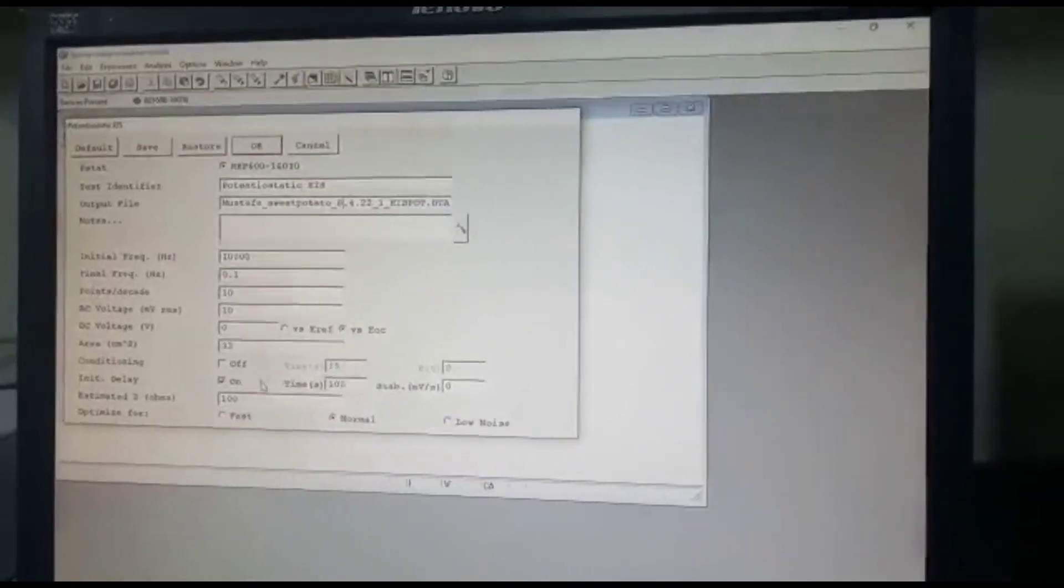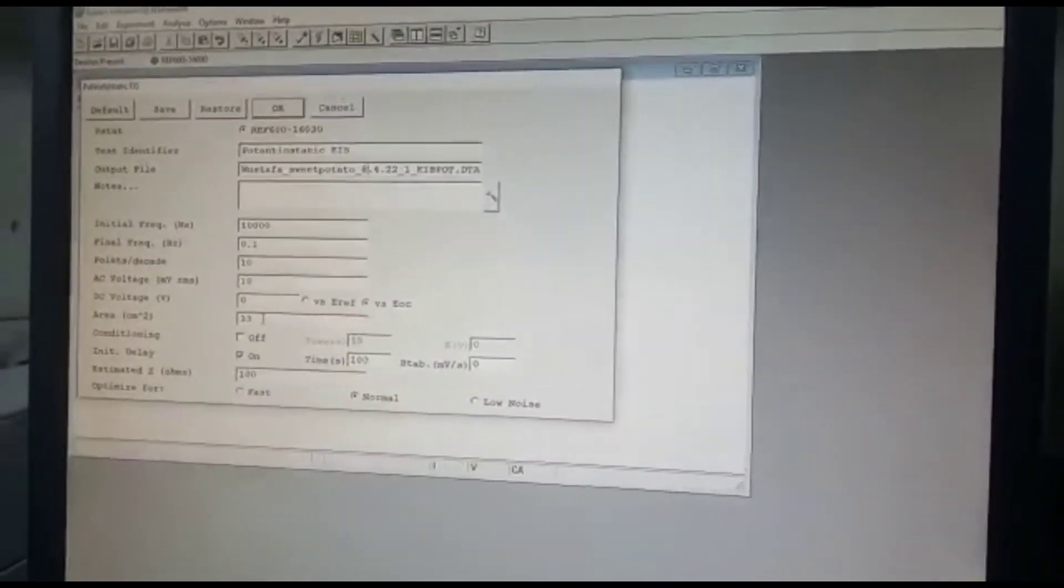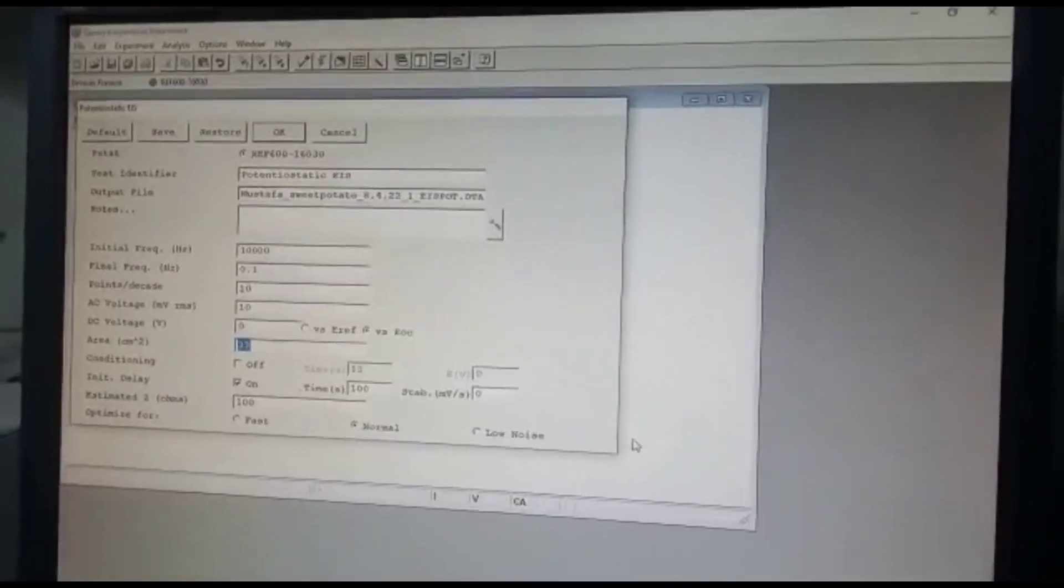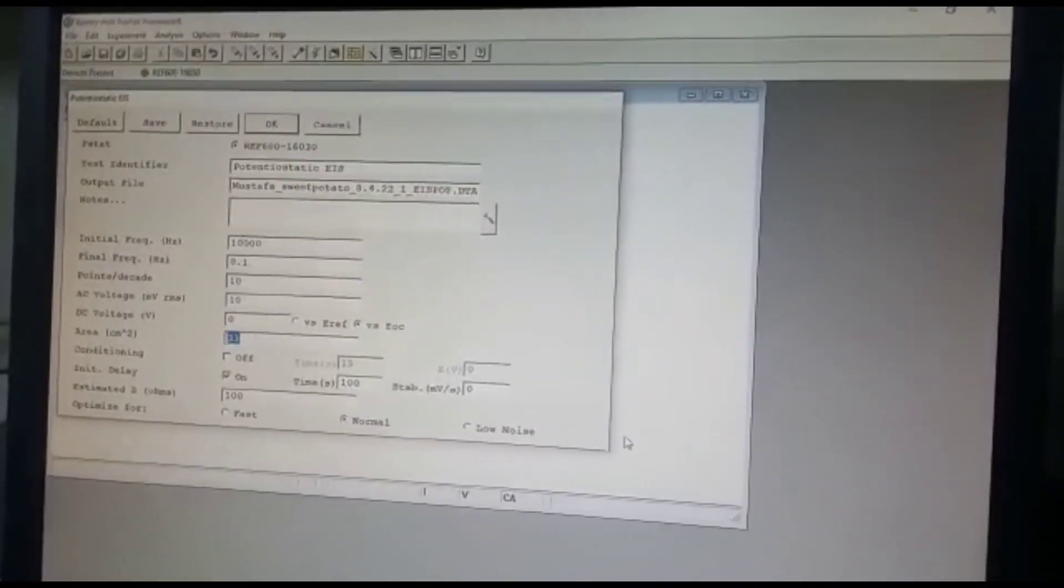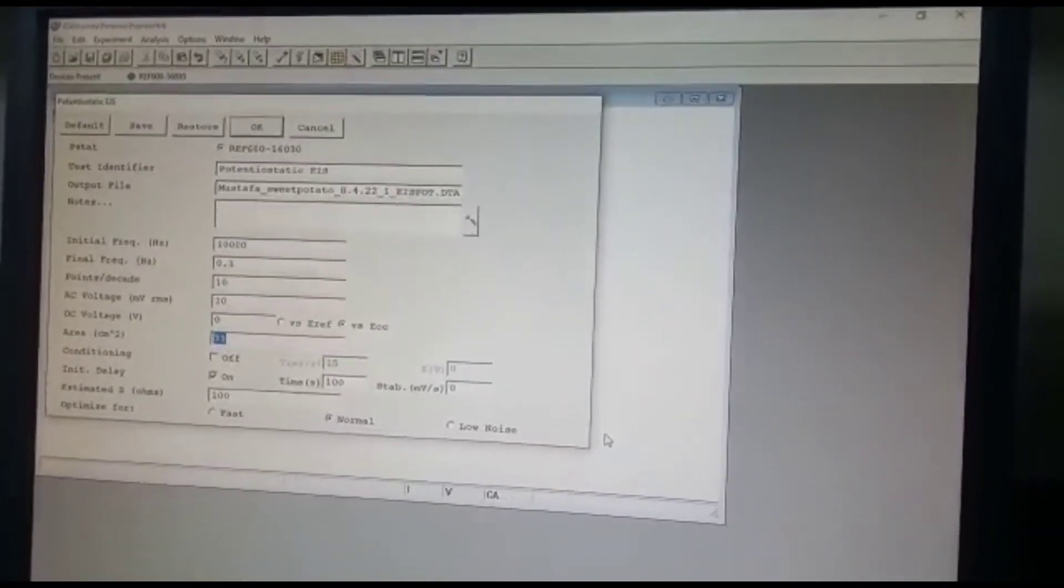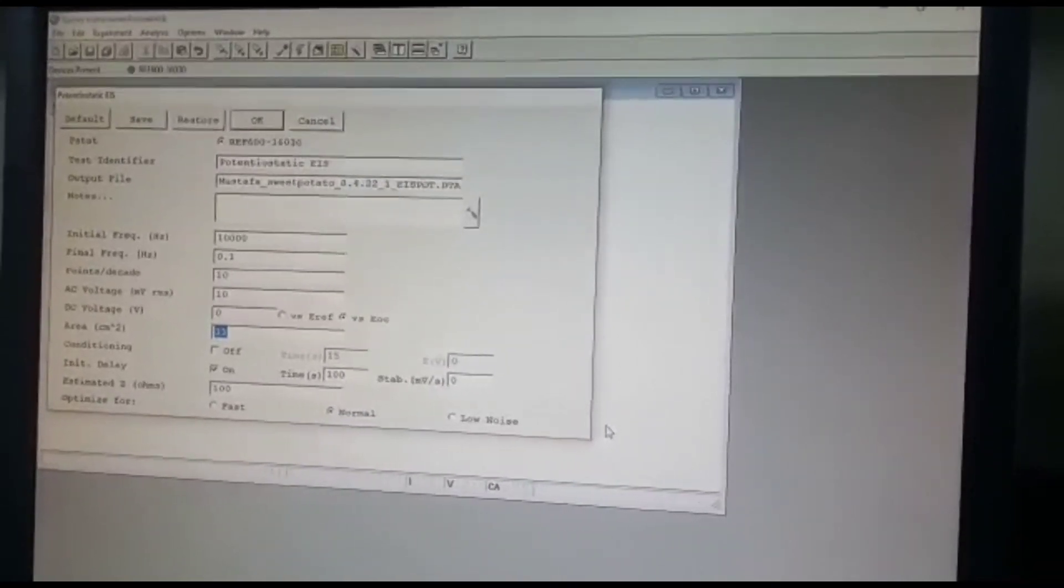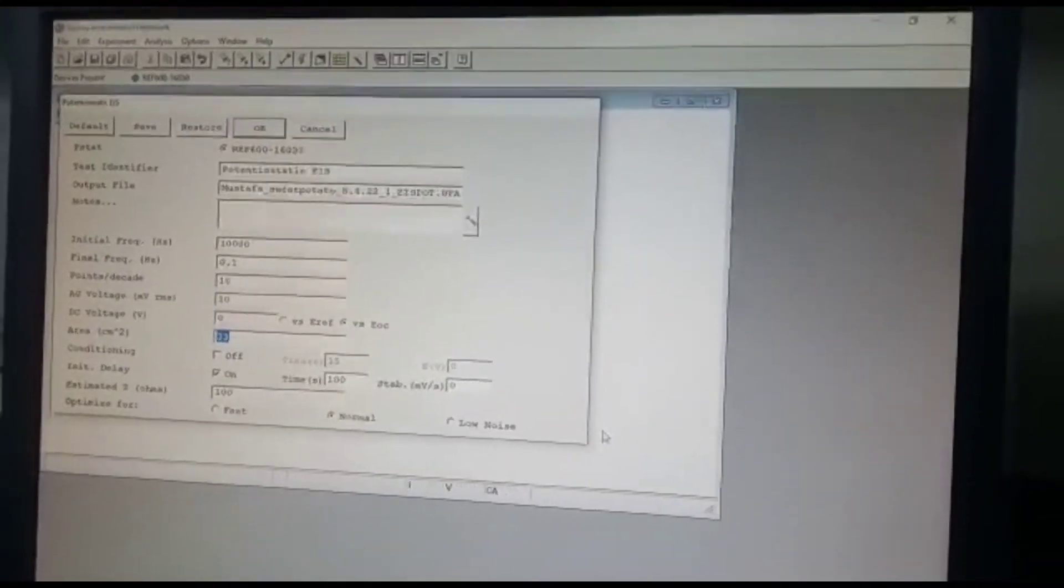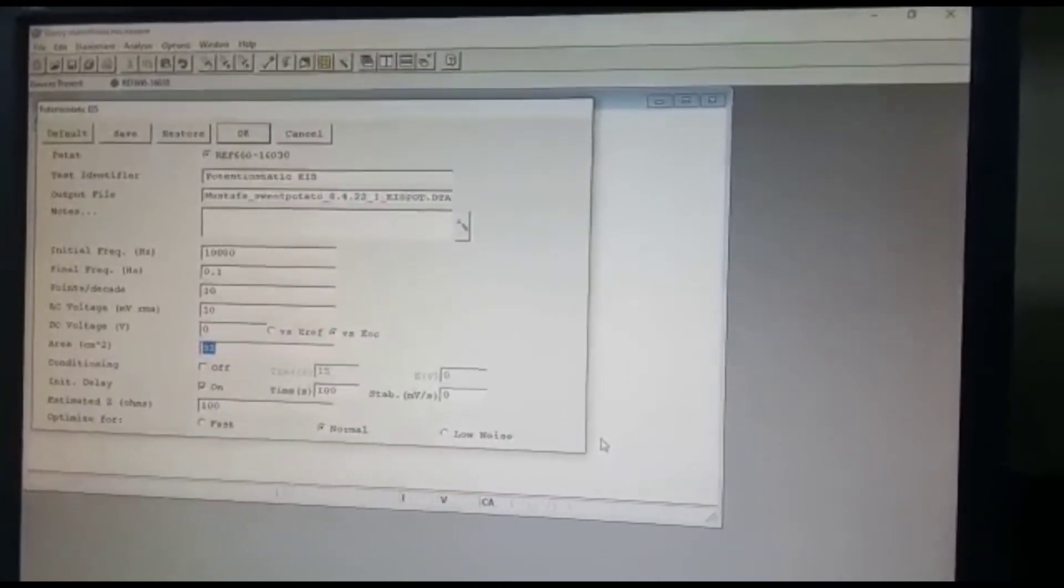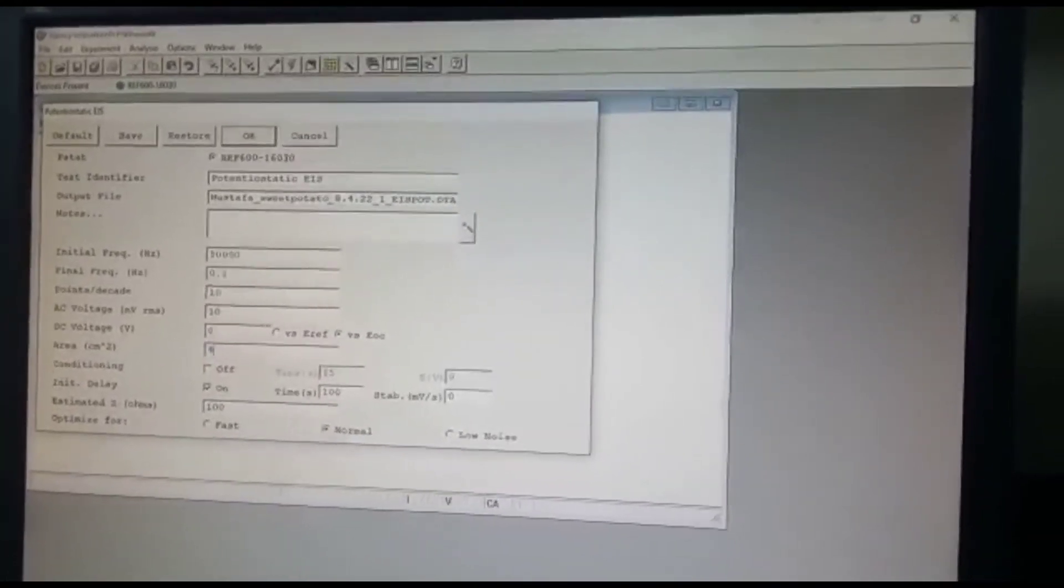And the area is also important. The area is actually set based on the area of the electrodes that you have. I think in this case the area that Mustafa, or my student, is using is 41.